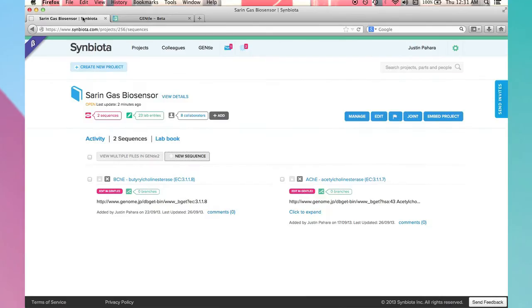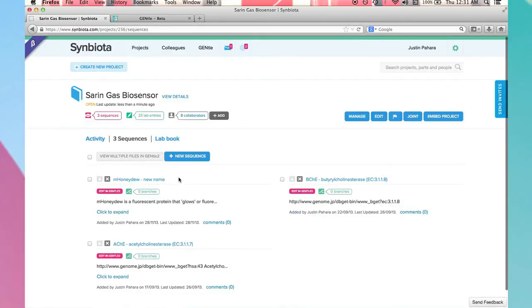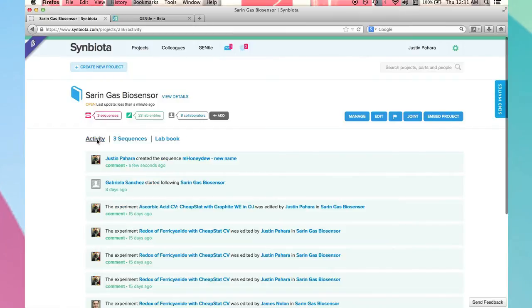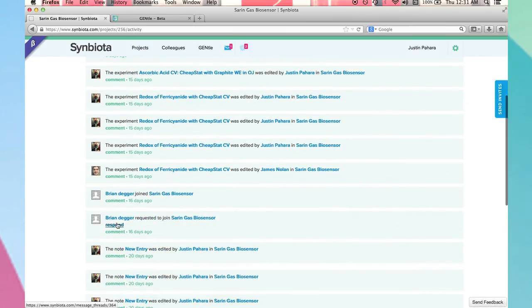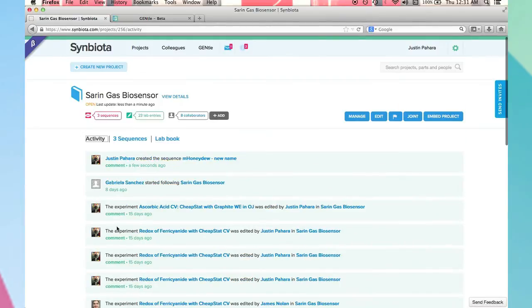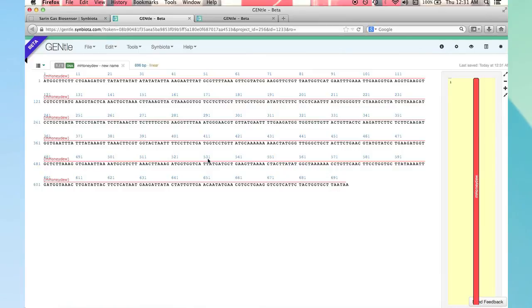Once back in Symbiota, I refresh and I see my new sequence. Lastly, I navigate to the activity feed which pertains specifically to this project. This is where I can see and quickly access all activity for this project. For example, I can click on the DNA sequence link I just created to directly view that work.